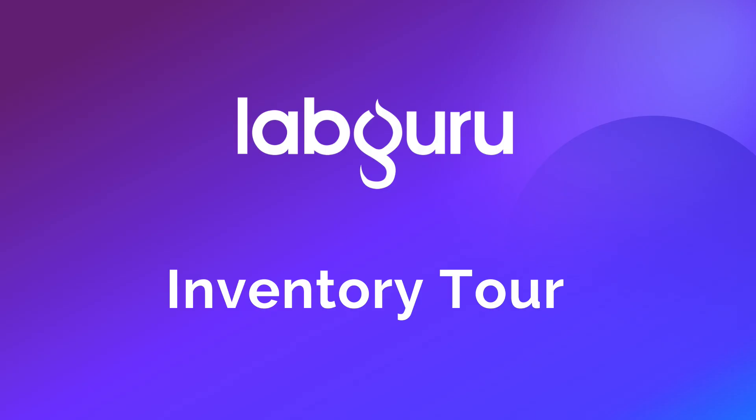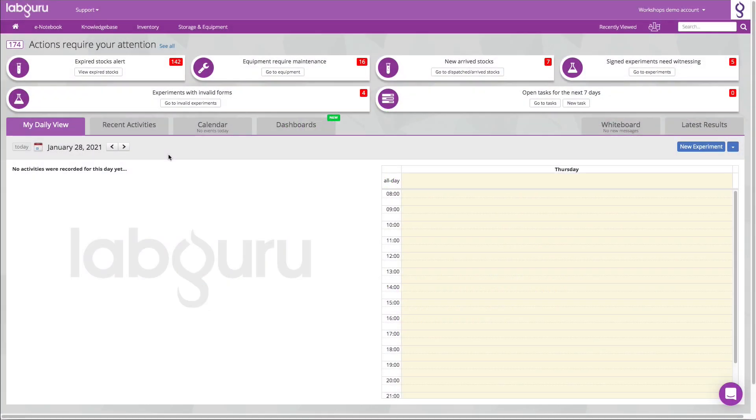LabGuru inventory management module enables you to gain control and keep track of everything in one place, manage your stock levels and new orders, create stock alerts, and easily share inventory locations with all lab members so everyone is up to date. In this video we will elaborate on how this is easily done with LabGuru.